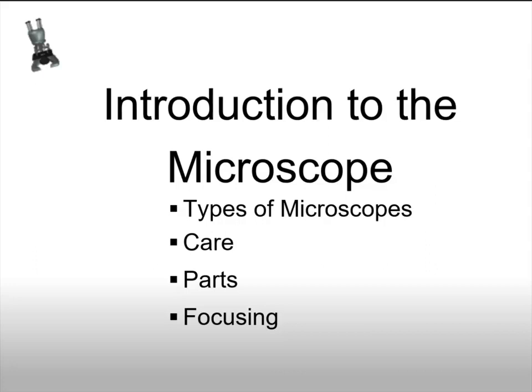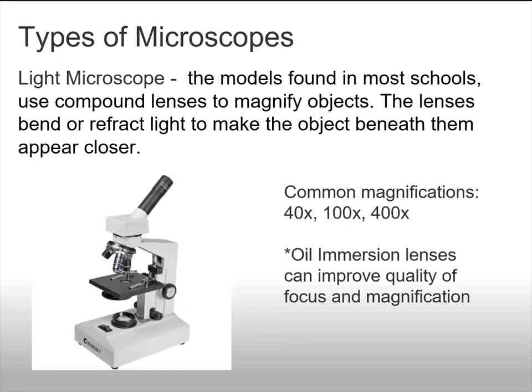Hey everyone, today we're going to talk about microscopes. We're going to talk about the different types of microscopes, just kind of an introduction to them, how we care for them, the parts of the microscopes, as well as the types of microscopes that we have in class available to us. So the first microscope we're going to talk about is called the light microscope.